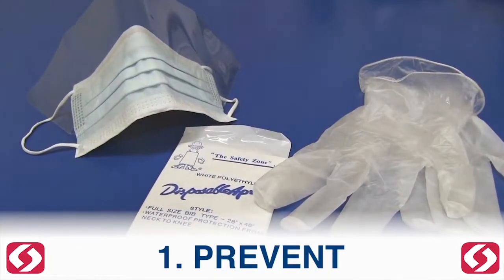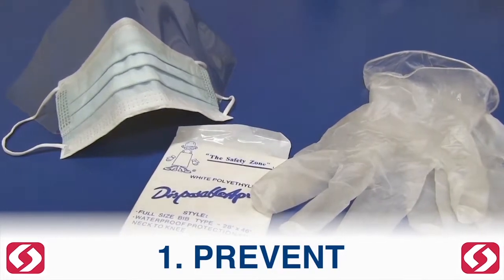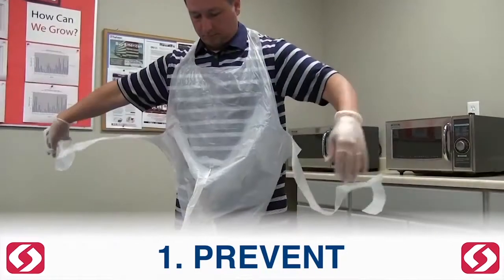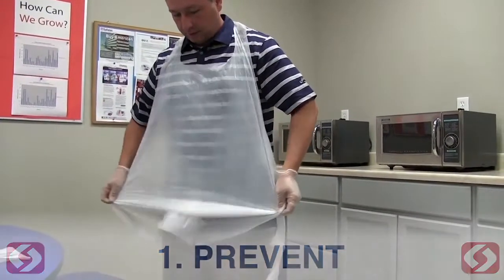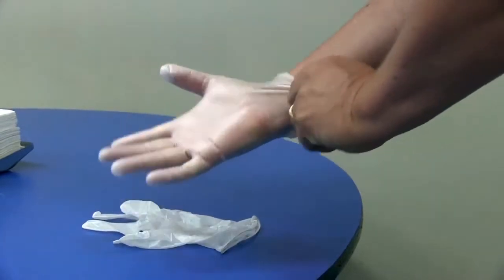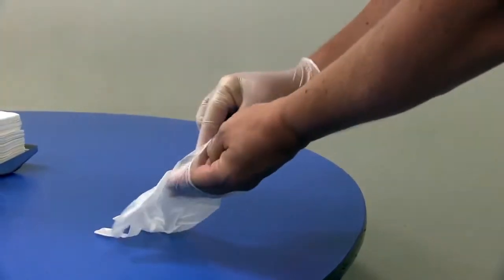Prevent. To prevent direct contact with the spill during the cleanup process and minimize the risk for infection, disposable protective clothing must be worn. This includes gloves, combo mask, safety shield, and protective apron.